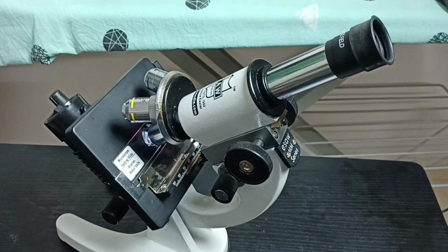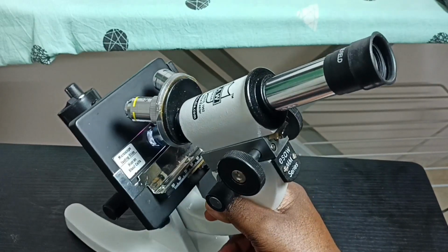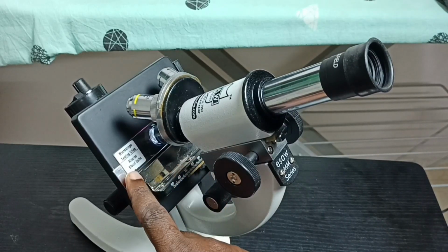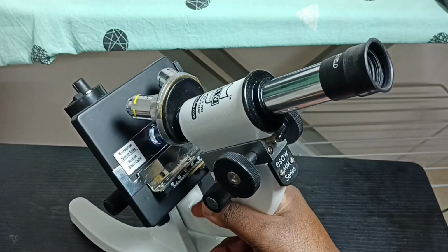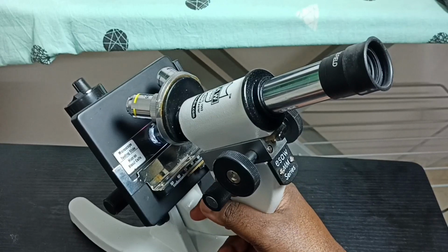Hi friends, this video shows how to capture a picture of the object using a mobile phone. So here you can see I have placed this testing slide on this microscope. Here I am using this human blood cells testing slide. So I already placed this testing slide here on the microscope.